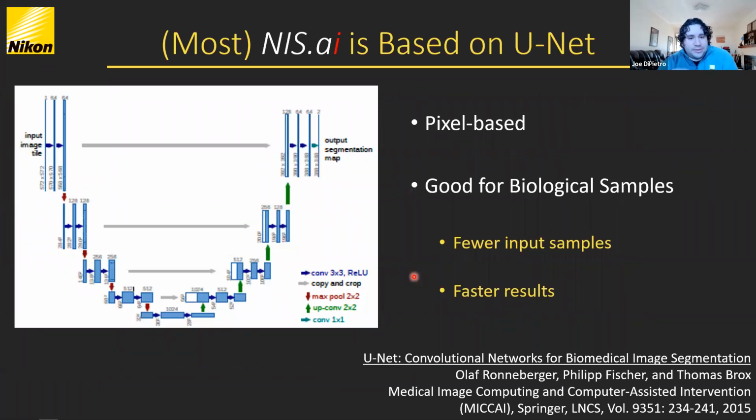Before I get into it, because a lot of people ask this, what are our artificial intelligence networks based on? They're based on UNet.